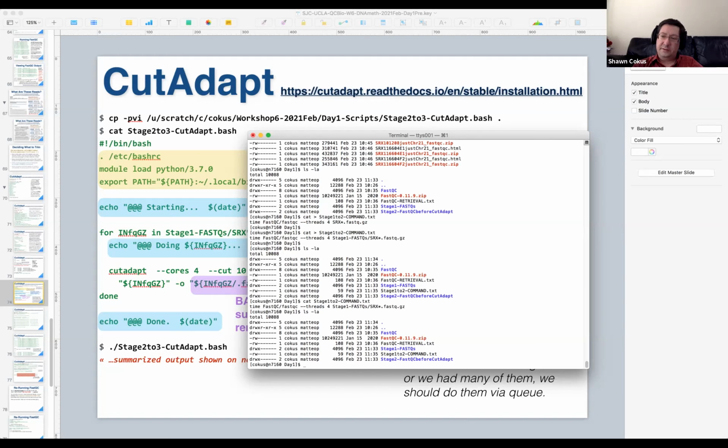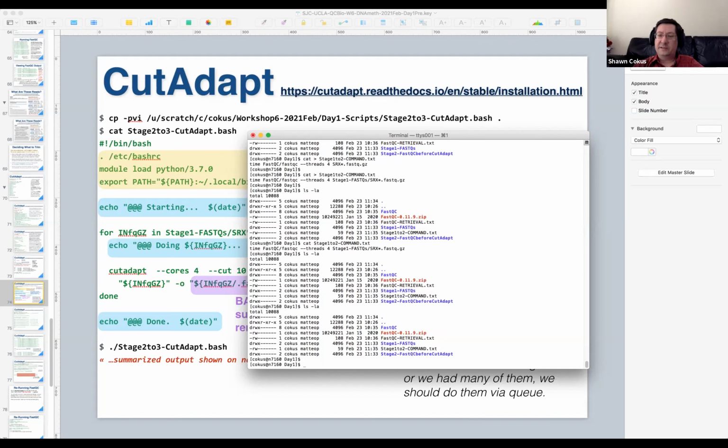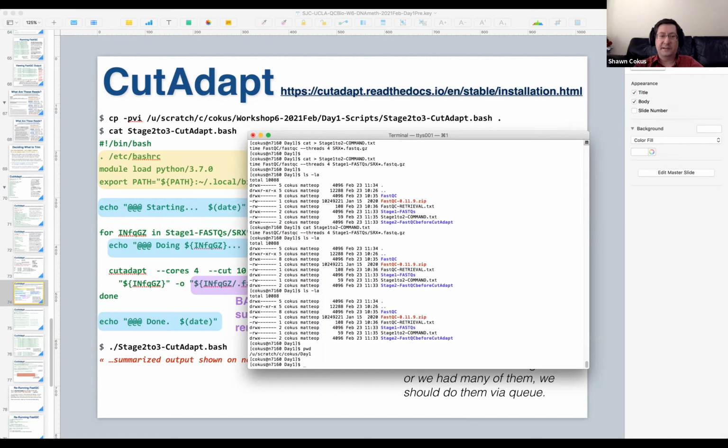One nice way to do it is, the first time you do the analysis, actually write the script then, and run that script. Then you know that script is the thing that produced the analysis, because it made the original analysis, instead of trying to take notes later, with possible accuracy issues. So you're going to grab a copy of the script and bring it to your current place. The script is currently in my Scratch directory, and you're going to copy it to where you are now. You're currently in the working space of your Scratch pile, and now we want to copy this one shell script into your place from my place.